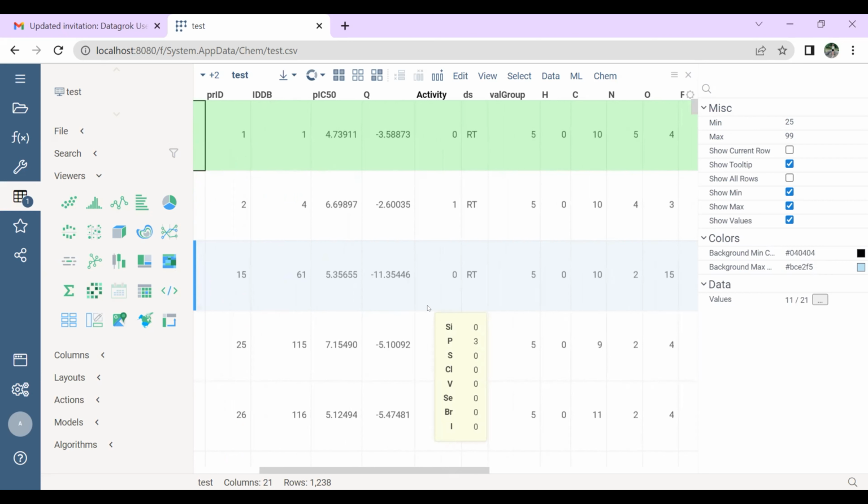I've never seen any chemist trying to create a representation like this actually, because it's not super useful. Unless you're very interested in some specific atoms, like for instance, a number of carbon atoms, you can sort them, or I guess the number of heavy atoms, which is a useful feature. But showing all elements like this is not super useful.